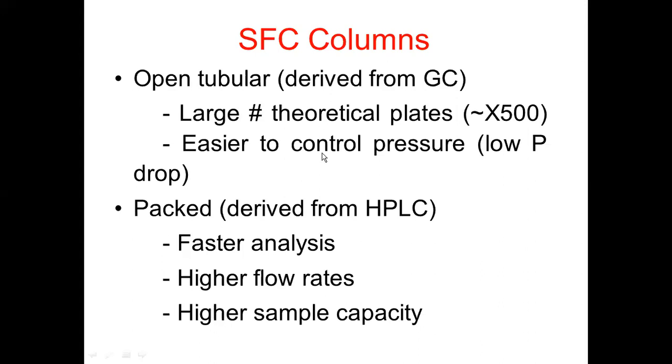Therefore, the band broadening will be minimum, the height of the theoretical plate will also become minimum, and hence, as a consequence of the low height of the theoretical plate, the column efficiency will become very high. Therefore, the number of theoretical plates while using open tubular columns of gas chromatography for supercritical fluid chromatographic separation will be at least 500 times greater.